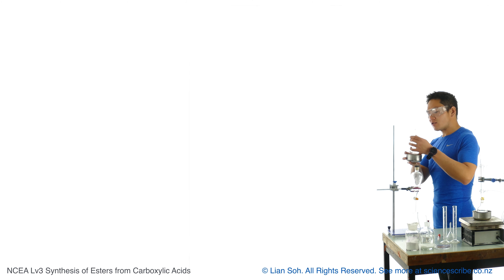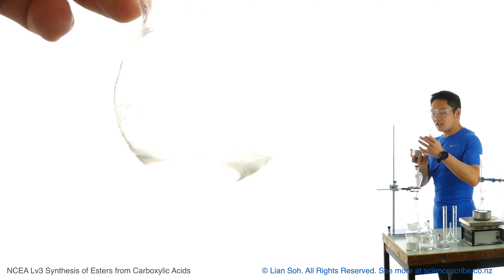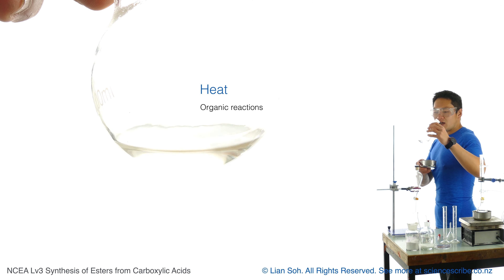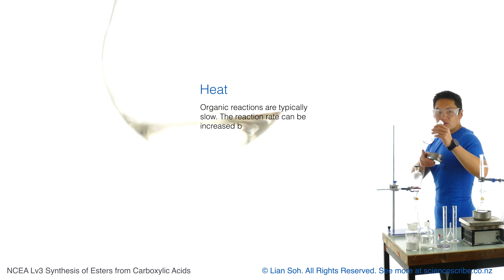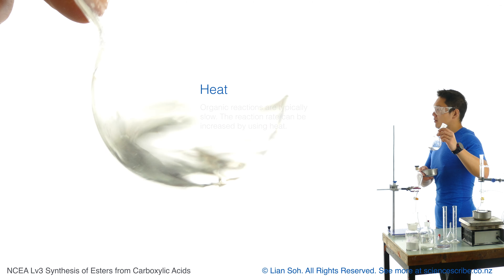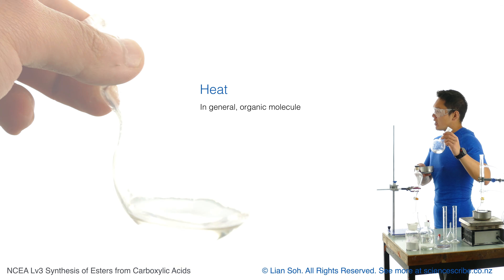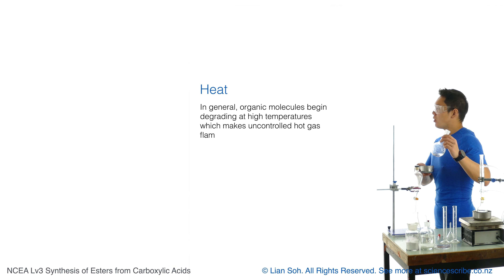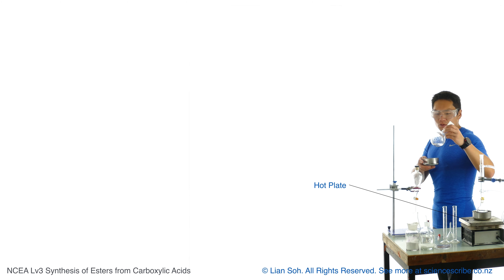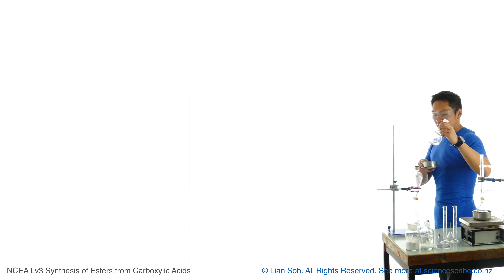To make this reaction go even faster, I'm going to apply heat to the bottom. Usually in high school practicals, you would use a Bunsen burner for that. The problem with a Bunsen burner flame is that it can get really hot, which is not what I want. I want a gentle, even heat distributed along the bottom of the round flask, so I'm going to use a sand bath instead.